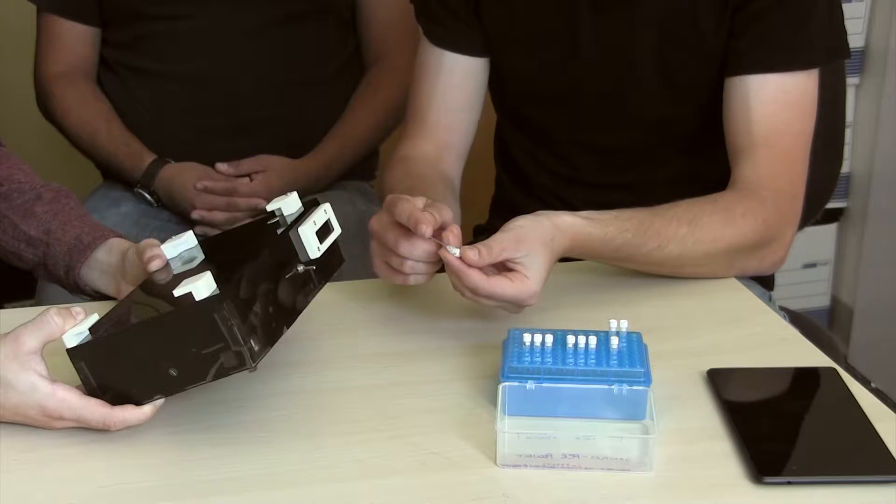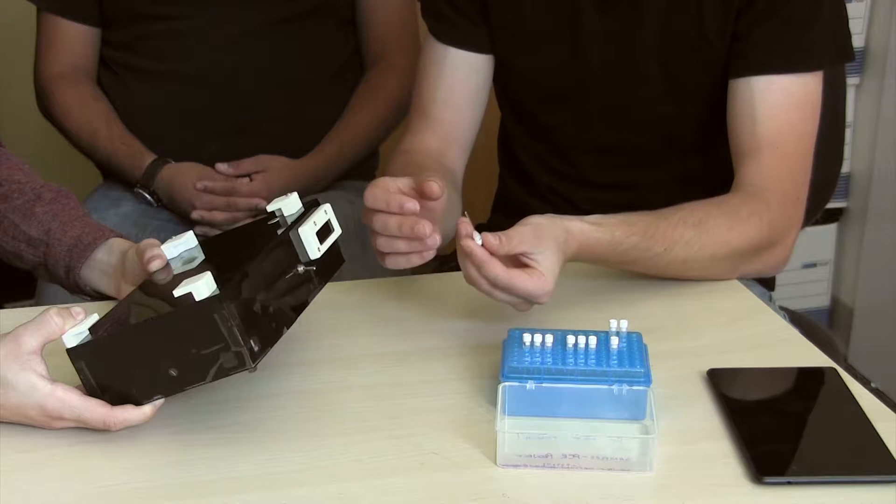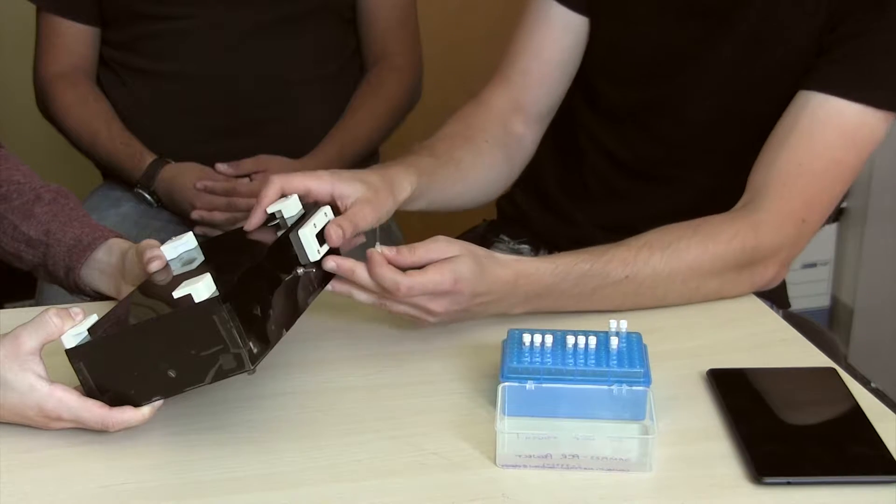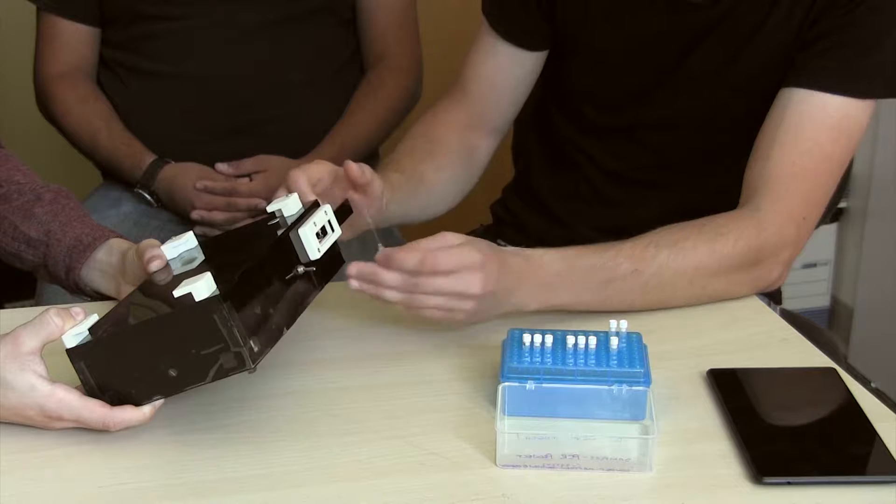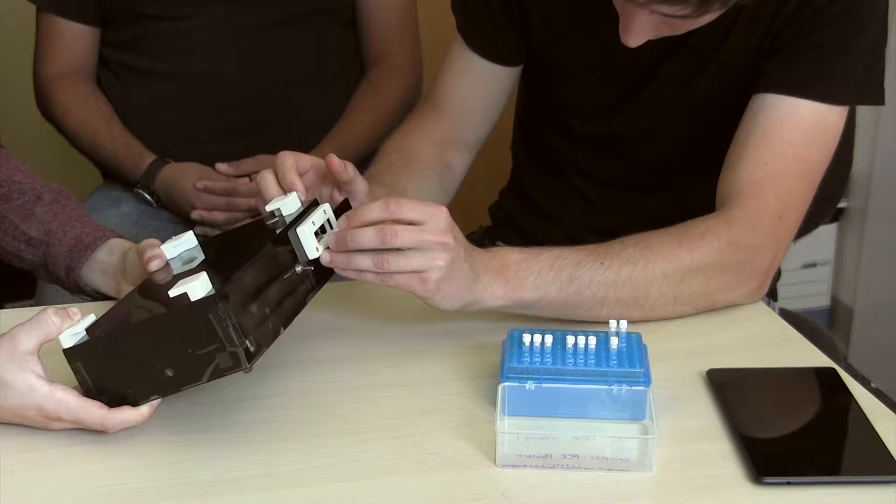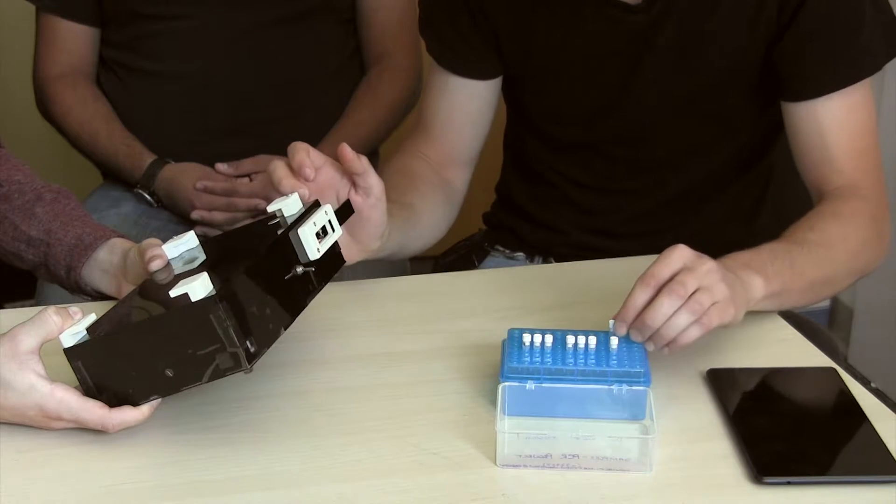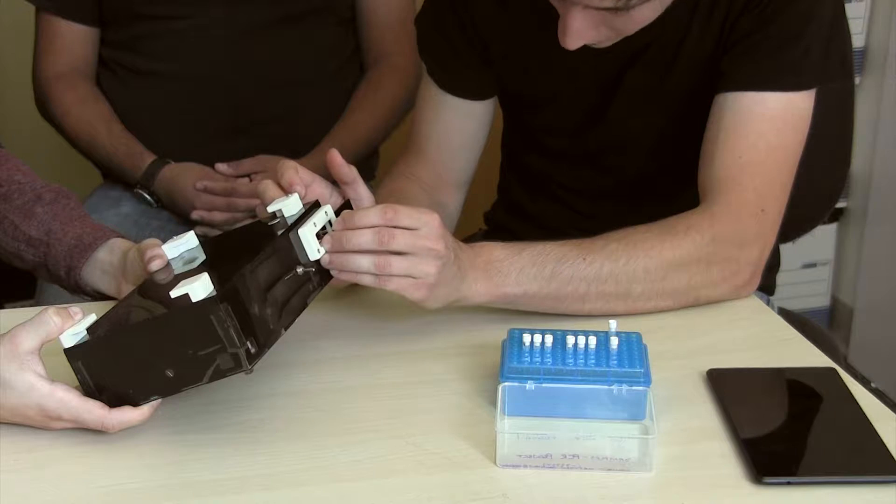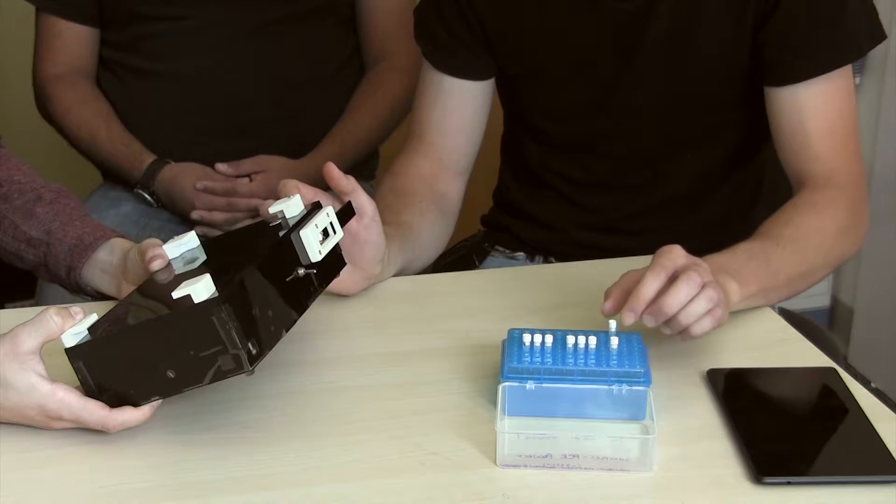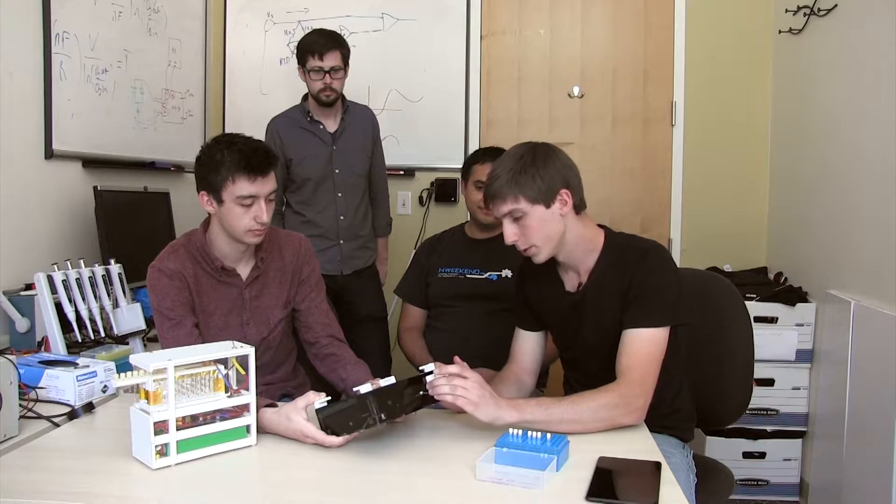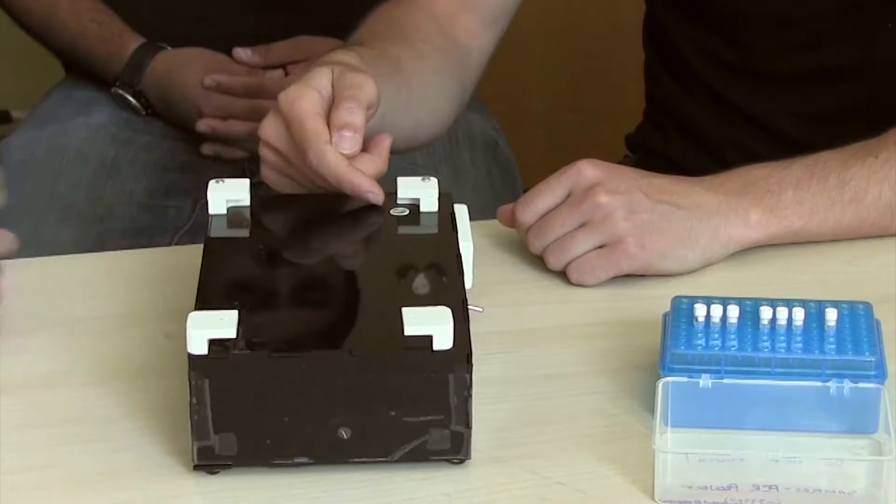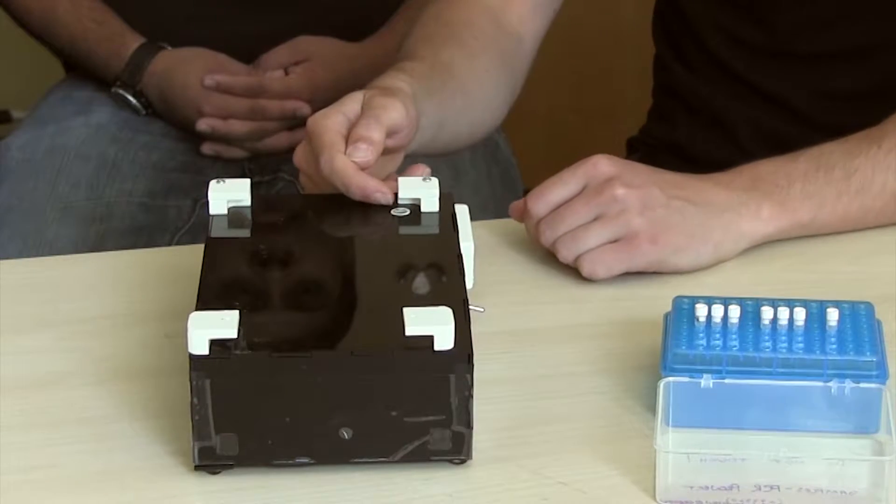To start off with, these are the samples that we're actually running PCR on. They have a little bit of DNA and some other chemicals, and we have a little sample holder on the side. You slide these into it - it's an aluminum block mounted on top of what's called a peltier junction that actually does the heating and cooling. And close that up. On the top here you can see there's a little circle - this is actually a viewing window.